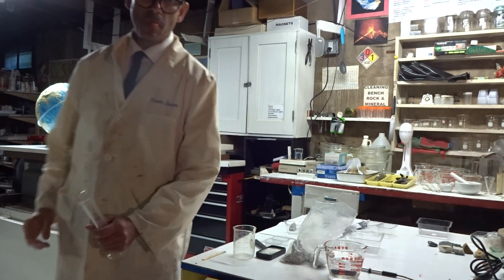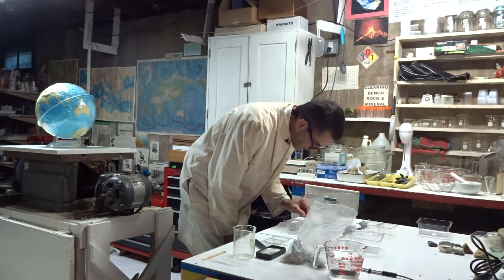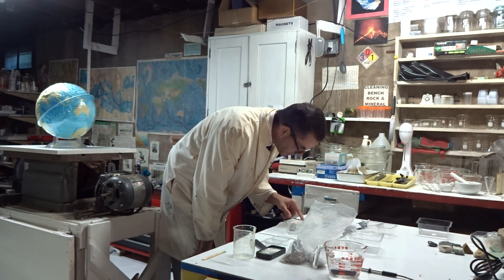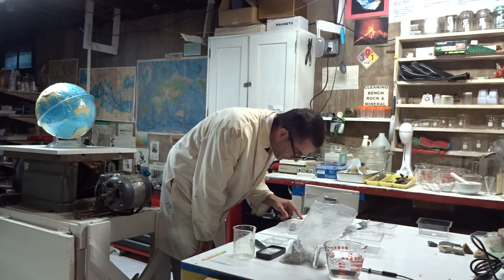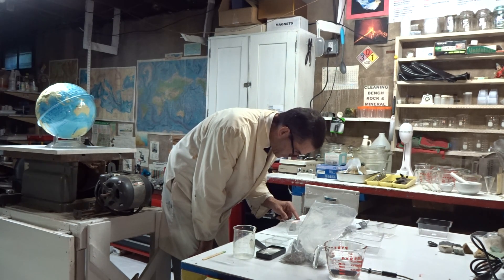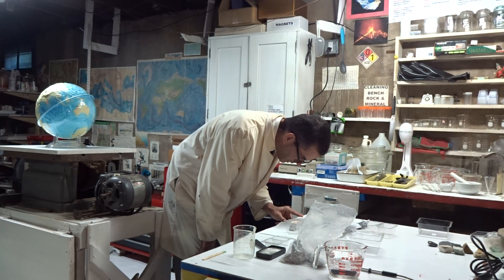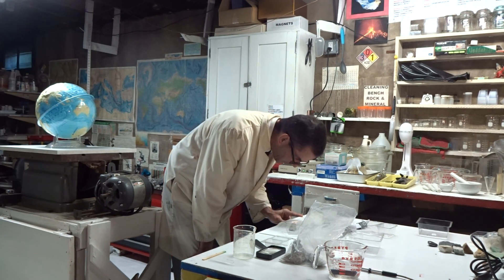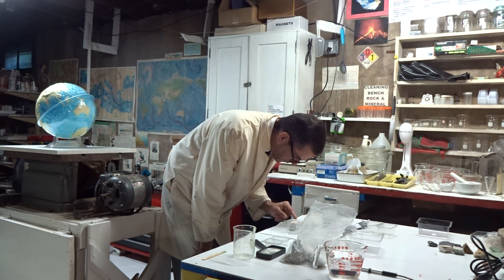We're going to let that come to a boil, and while it's boiling we'll continue to read the procedure. Using a clean spatula, carefully look at the grains — we did that. Now pour the boiling water from the small beaker into the size C plastic growing cup, which contains the contents of the zeolite chemical. Stir with one of your wooden spatulas until all the chemical grains have dissolved completely.